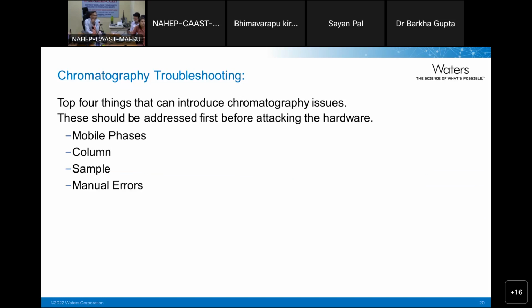If you have some problem and you want to troubleshoot, before jumping onto the hardware, it is better to check these things first, because in most cases we have found out these are the primary cause of the problem.